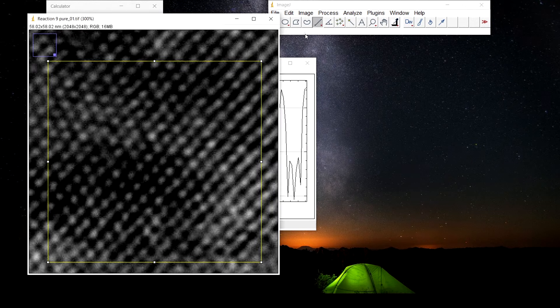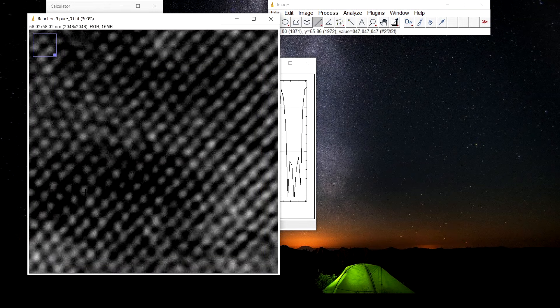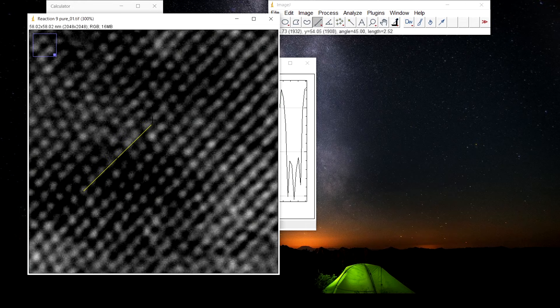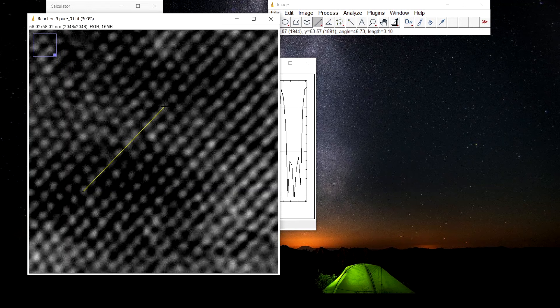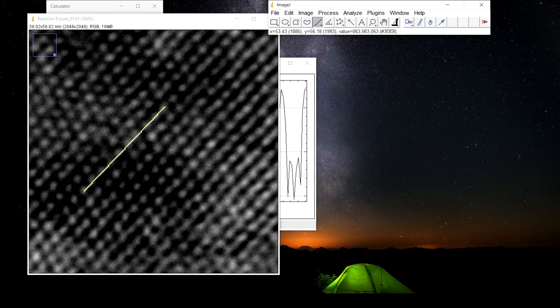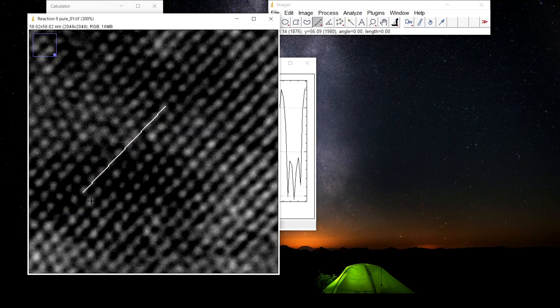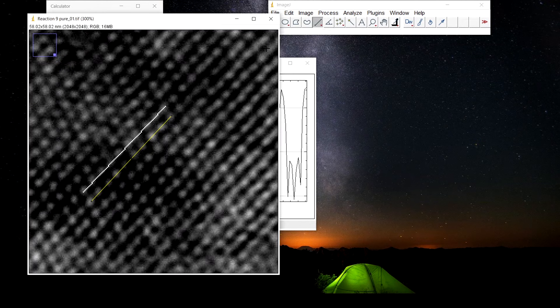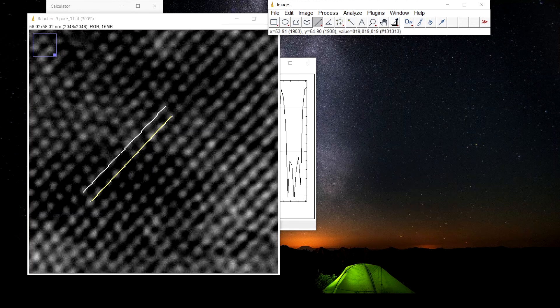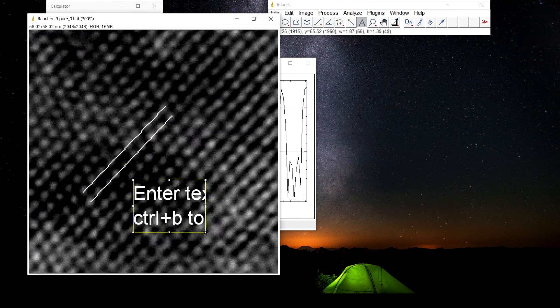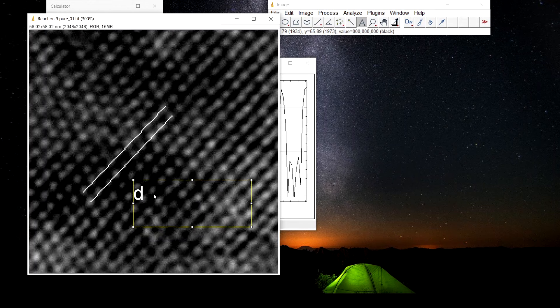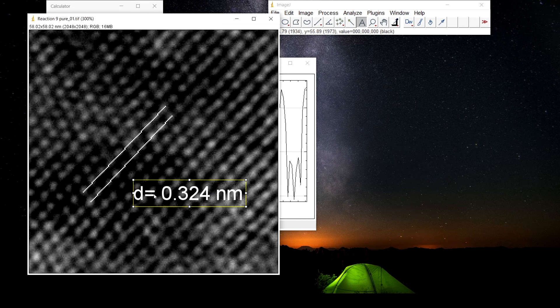Here we have the image, we will draw a straight line here. D is equal to 0.324 nanometer.